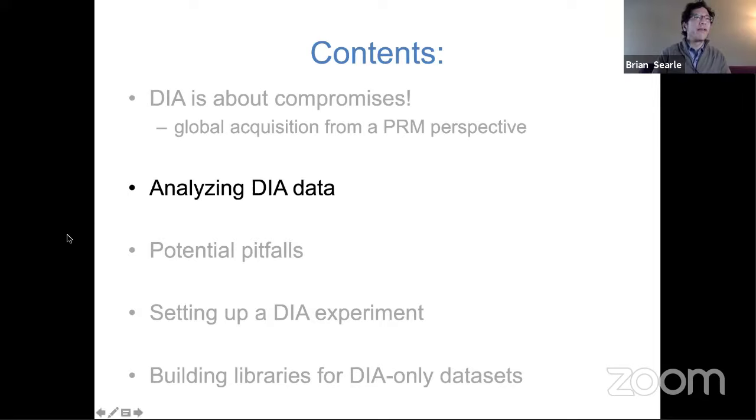What is the effect of the taper on the relative quantitation of peptides and proteins? Because the same windowing scheme is going to be used in each acquisition, the same tapering effects will be consistent for that peptide in each one of your experiments. So relative quantitation is going to be fine, but you'll see a decreased overall intensity in that peptide than you would otherwise have if you had targeted specifically for that peptide.